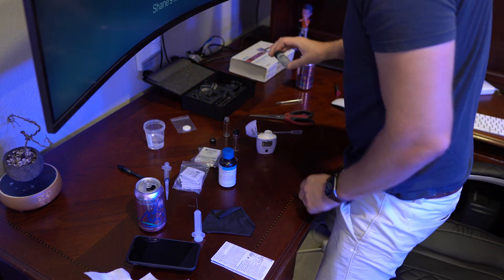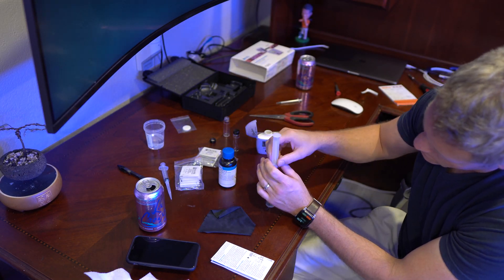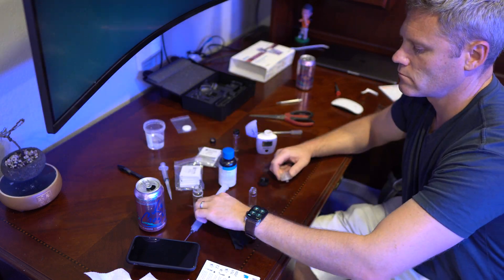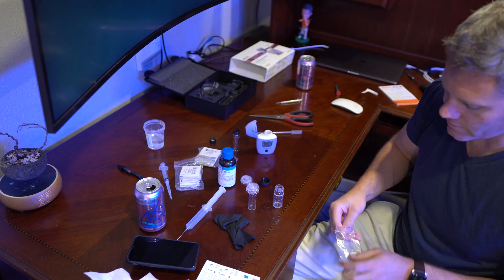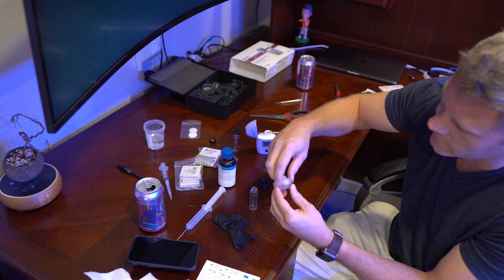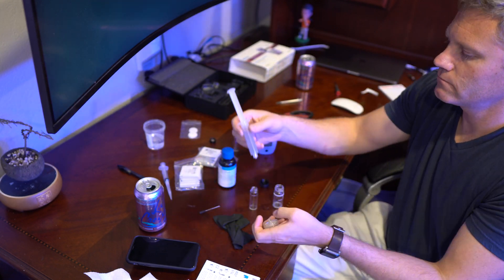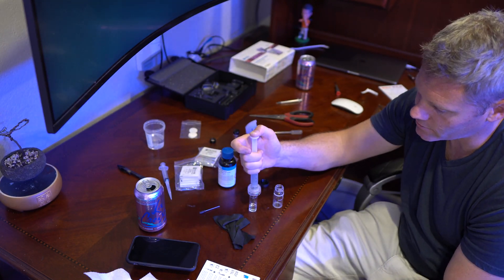But overall, for most people that I know within the reefing hobby, I don't think they're that concerned about having an exact amount of nitrates. They just want to keep a range. Some people are high ranges, like between 10 and 15 — I'm fine. Where other people are lower range, between 0 and 5 — I'm fine. So it really just depends on if the added time is worth getting the accuracy for you.